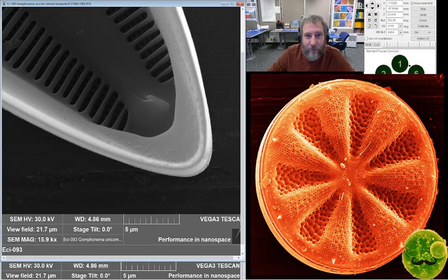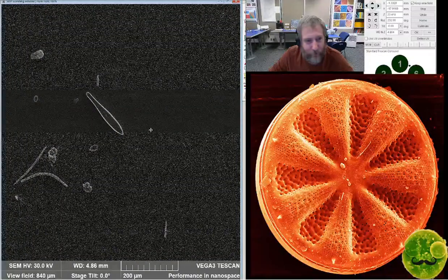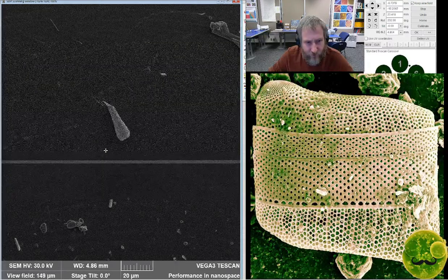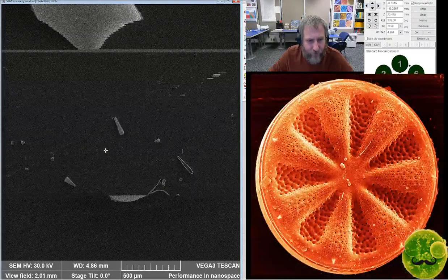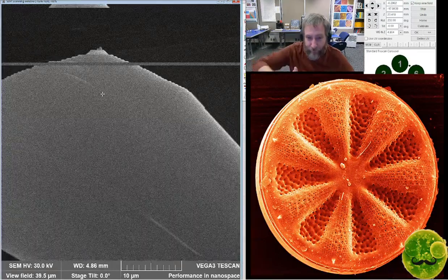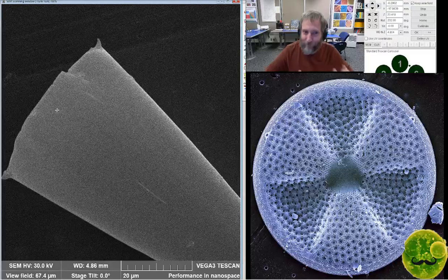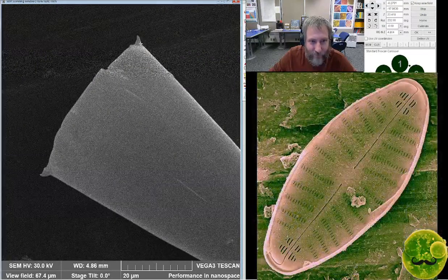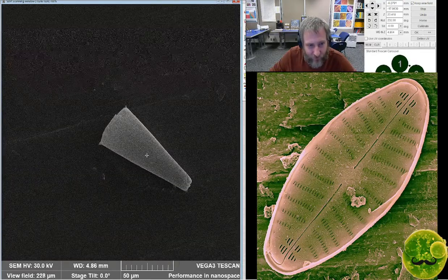All right, there's the head pole internal. Let's go see if we can find the unicorn horn and get a picture of it for Constable. Wrong diatom. Zooming out. Right diatom. This is the same diatom in girdle view or side view, so that you can see what it looks like on its side, like valve view, girdle view, right? Side view, profile. This is what it looks like in profile. See? Unicorn horn on both sides. That's what the diatom looks like.